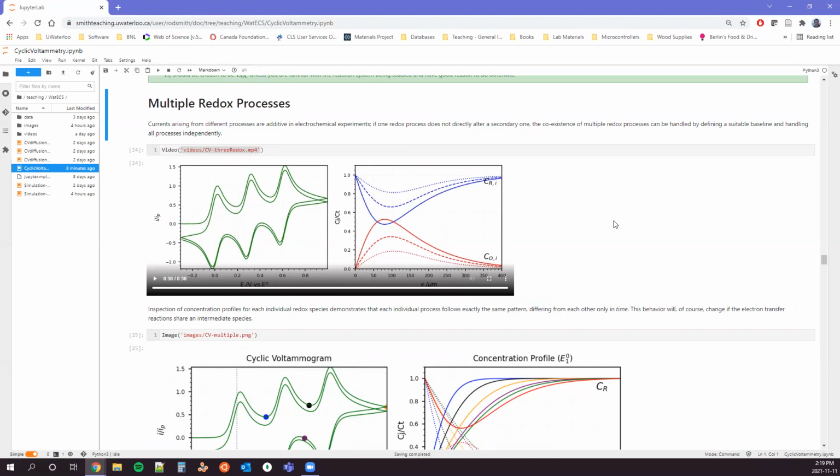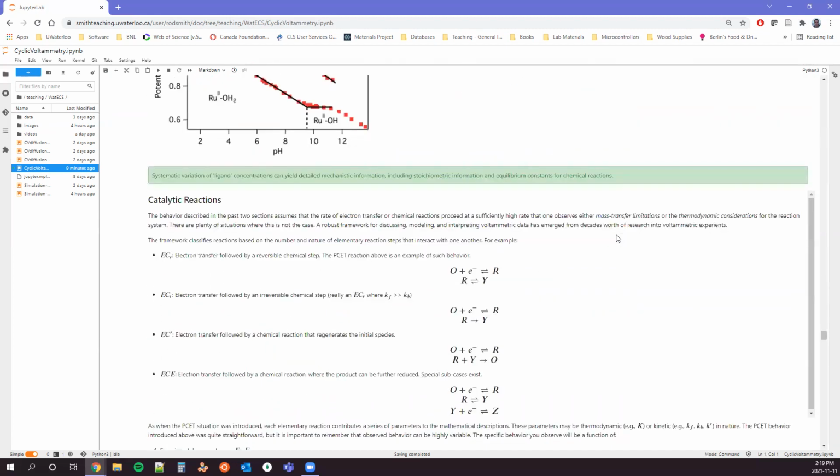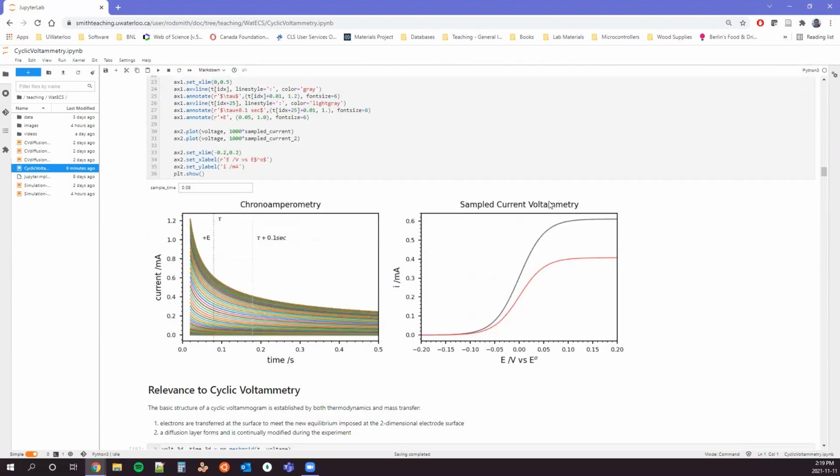And then I think a few more questions. Is it possible or common to do CV on flow systems like flow batteries or electrodialysis and ion exchange membrane processes? Yep. In that situation, you're taking mass transfer out, and so you'll see behavior more similar to this. With sampled current voltammetry, the key is that thermodynamics tells you what you start with, and then you have this limit because of mass transfer.